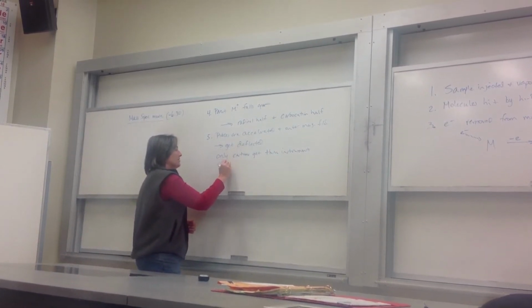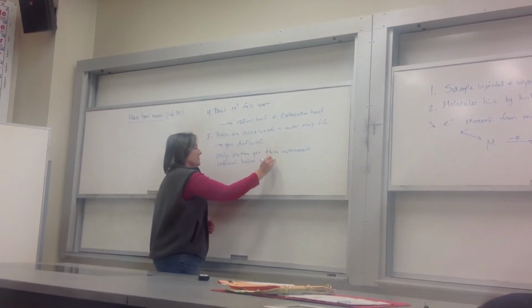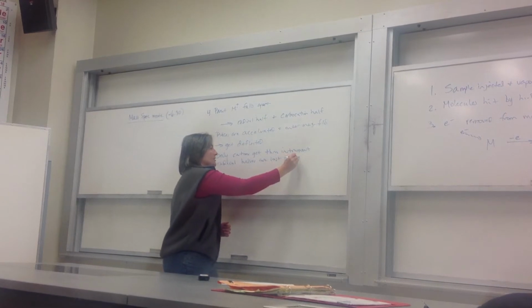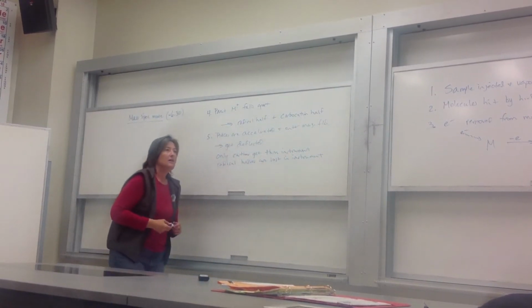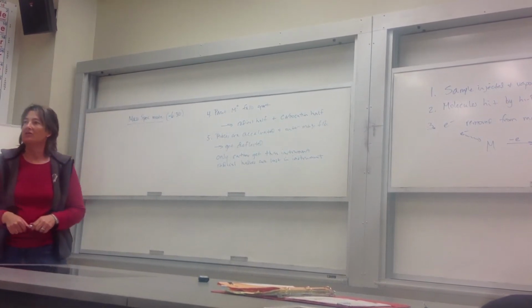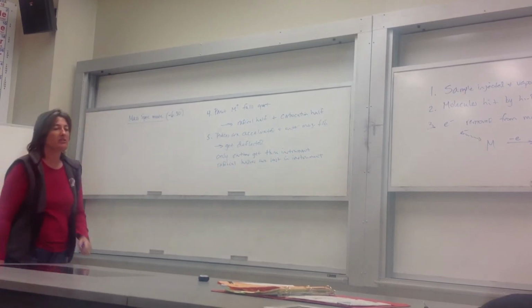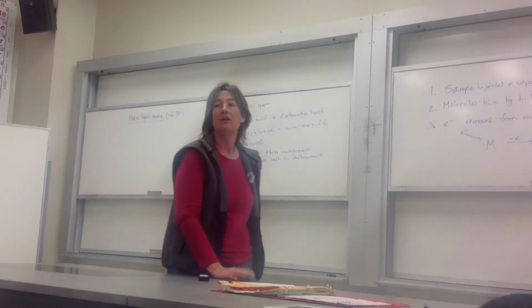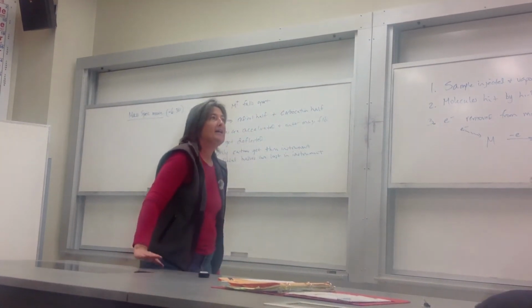And so the radical halves are lost in the instrument. Do they go out the vacuum pump or something? Yeah, they just go away. So it's not like you develop a crust inside your instrument and have to go scrape it off every once in a while. But they don't get deflected. So the radicals don't actually pass through this at all. Just the cations do. And they get passed through by mass.